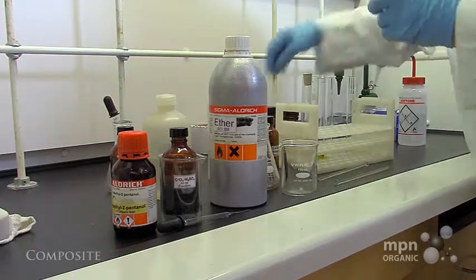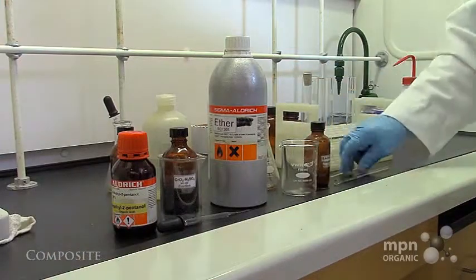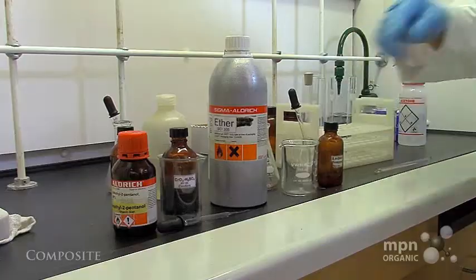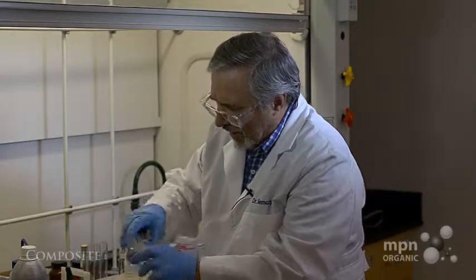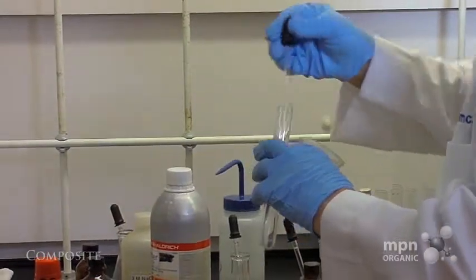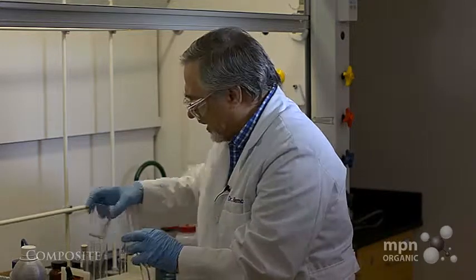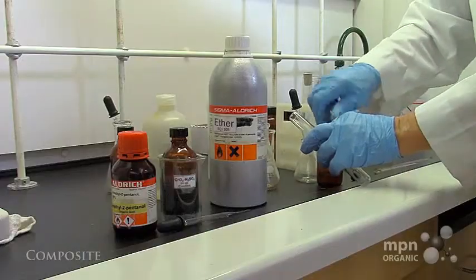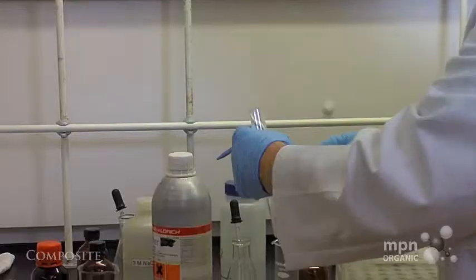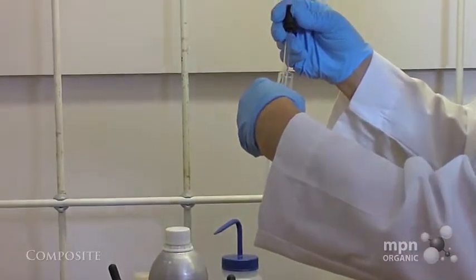Remember what that is. We take this yellow reagent. Let's bring that forward here. Take this yellow reagent and we add it directly to the compound. Let's take a look. Let's take just a couple of drops of this stuff out of here and put it in the test tube. And the result is the formation of a, in this case, it will be a yellow solid. So here's our 2,4-DNP reagent. Now let's see what we get.